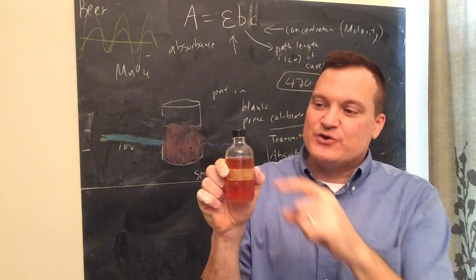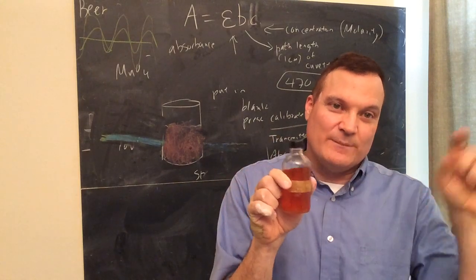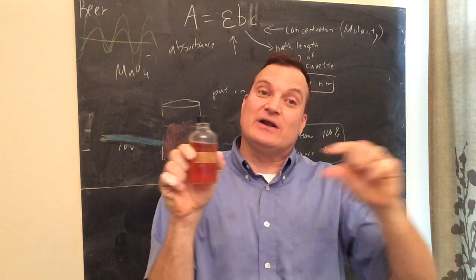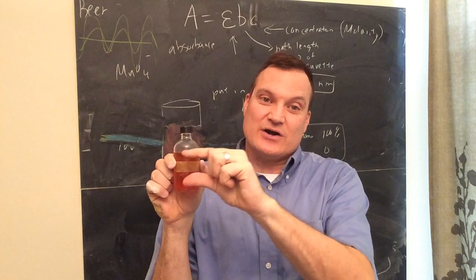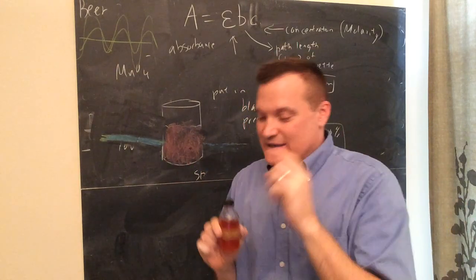And each one of them, you're going to put a little bit of this and then some water. A little bit water, a little bit water. They're going to get lighter and lighter. So you start with the darkest, then lighter, lighter, all the way to the lightest. So you have many different colors. Okay, that's what you have to do.